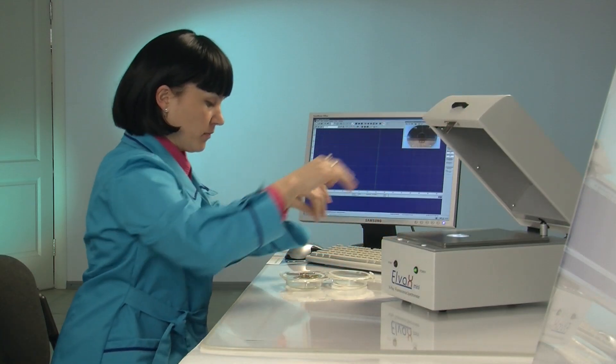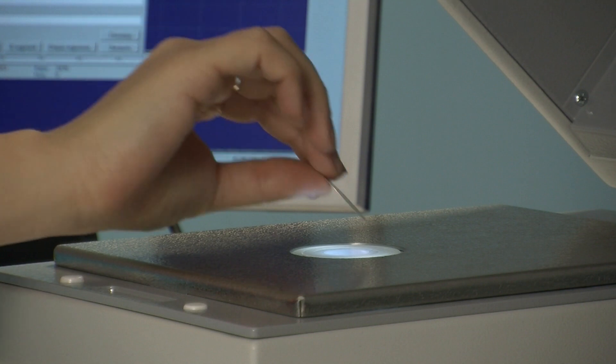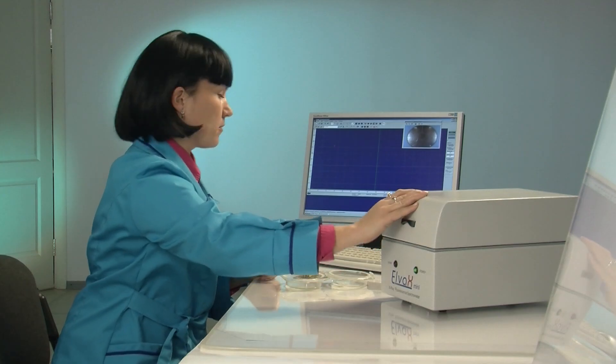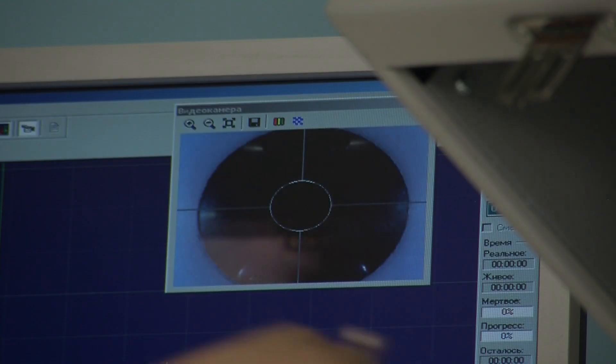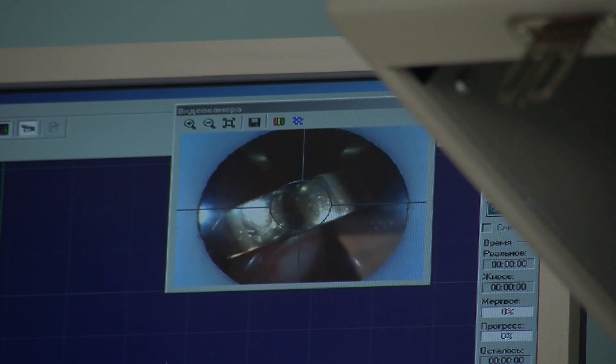The measuring process is completely automated and intuitive, which makes Elva X-Mini easy to operate even for a novice user. A sample is simply placed onto the sample window and spectrum acquisition is started. The use of a CCD camera allows you to position the sample precisely to test the required spot.